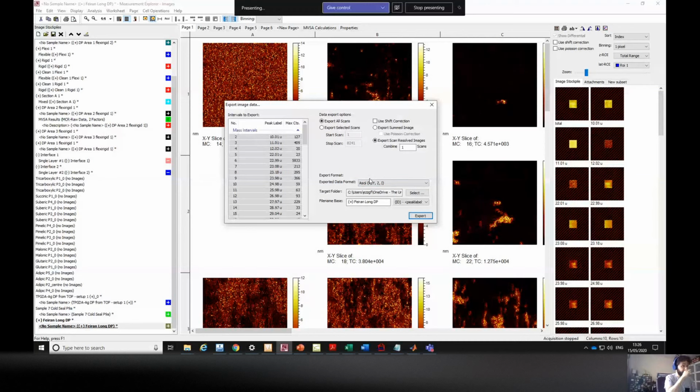Also, I recently found out that in this newest version, at least the version I'm using, there's a problem in SurfaceLab when you export 3D data using BIF6. For some reason, the first levels are merging more levels into them. I don't know what's happening. It's like you have the first 100 levels together in the first one.